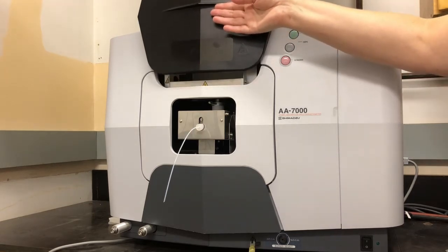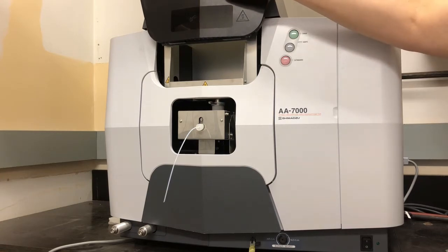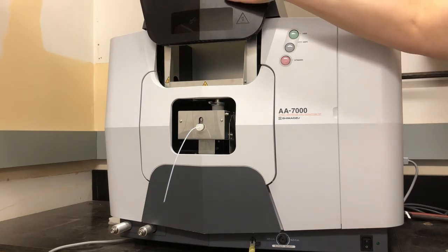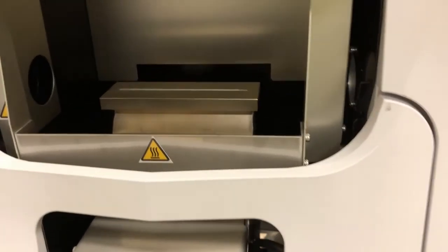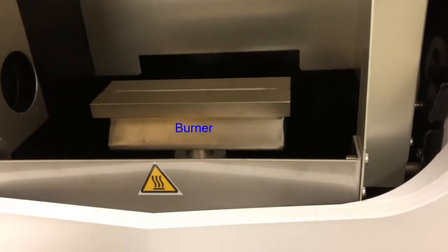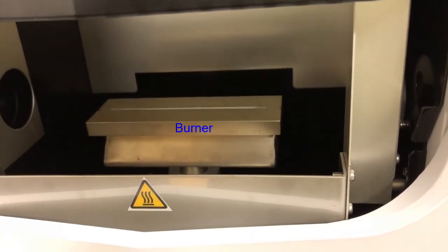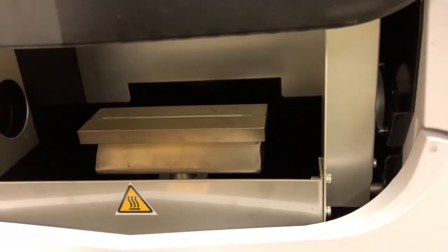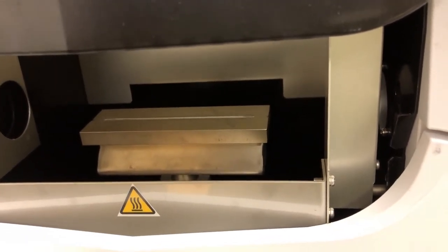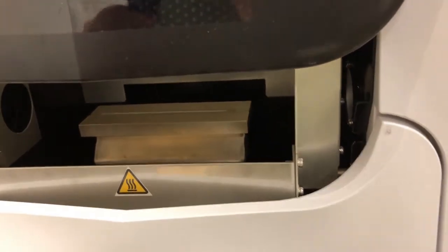Under this shield right here, which is there for safety reasons, you'll see a burner. If we move in closer on the machine, this is the burner head. That's where the flame will come out when we actually light it. When we light it, I'll come back and show you what the flame looks like. This burner is adjustable as well. We can adjust it using the software on the computer to make sure it's in the right position.